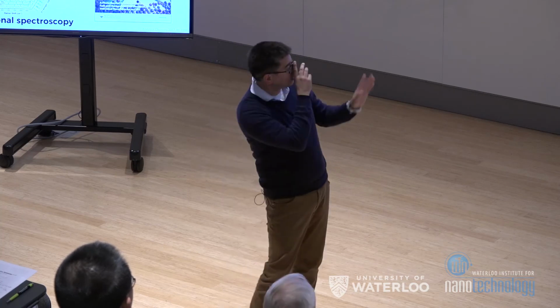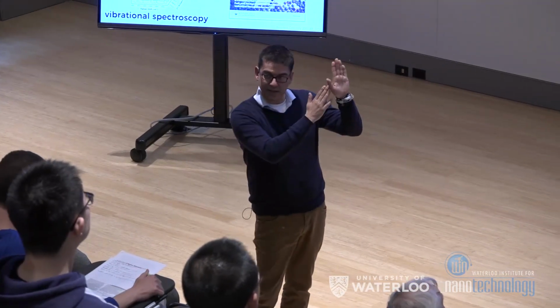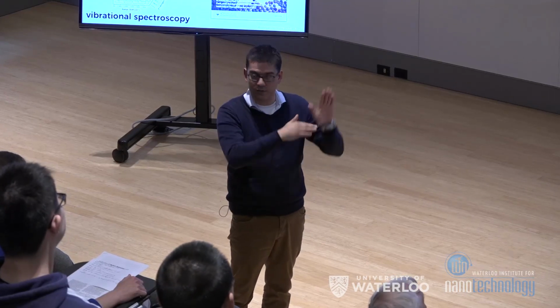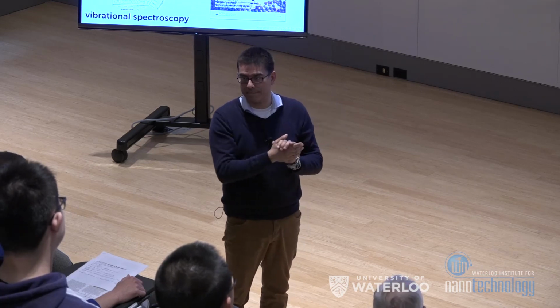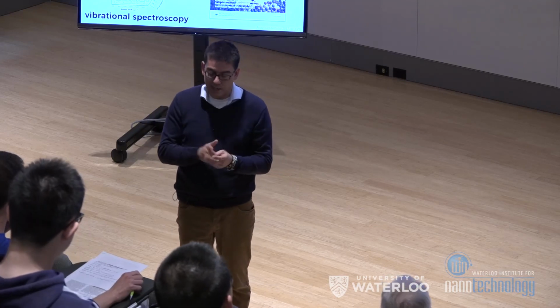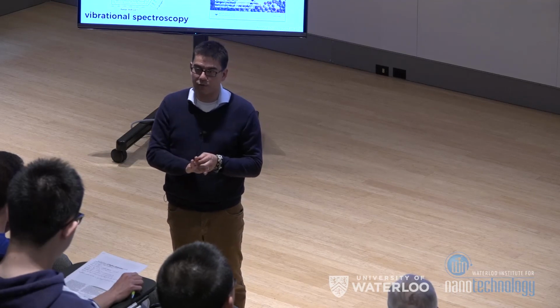If I was to show you, and I don't have the data in this talk, the dissatisfaction coefficient effectively drops down very quickly, and then we set some kind of threshold for the minimum drop per iteration. So you could continue this for a very long time, but normally within the tolerances you can do this quite quickly. So the optimization algorithms we use are at a relatively low level, so the SNOBFIT is.